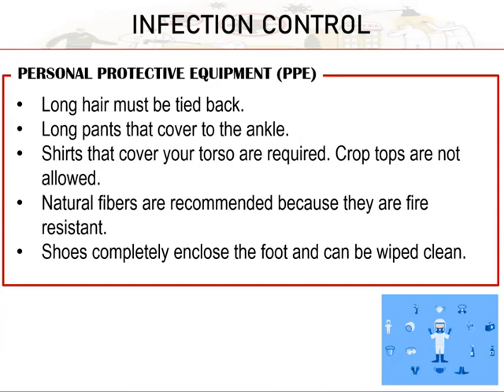It should be that the foot is completely closed. Actually, Crocs, class, are not ideal because they have holes. So if ever something spills on your foot, there will be direct skin-to-skin contact. That is why the footwear should be fully closed.